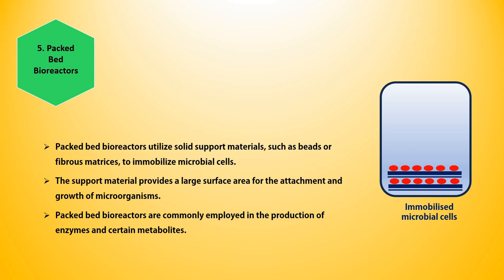Now, packed bed bioreactors. As the name implies, packed bed means here the microbial cells are packed onto a solid surface, for example beads or fibrous matrices, and we immobilize the microbial cells within those beads or within that matrix, and the rest of the region of the bioreactor is kept free.